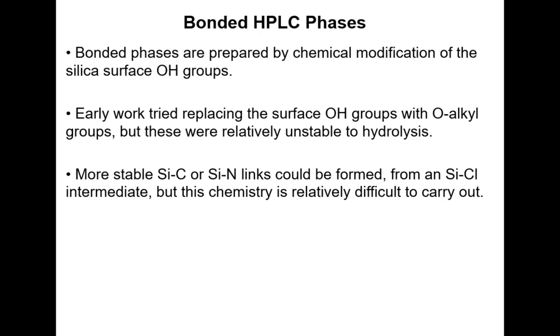Okay, so I'm making fairly good progress. So moving now on to the bonded phases.